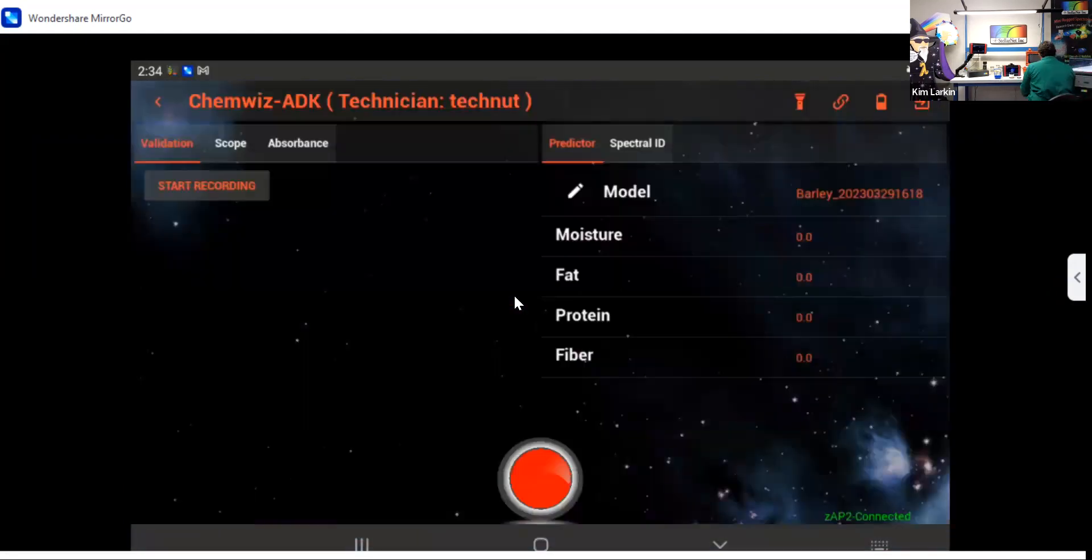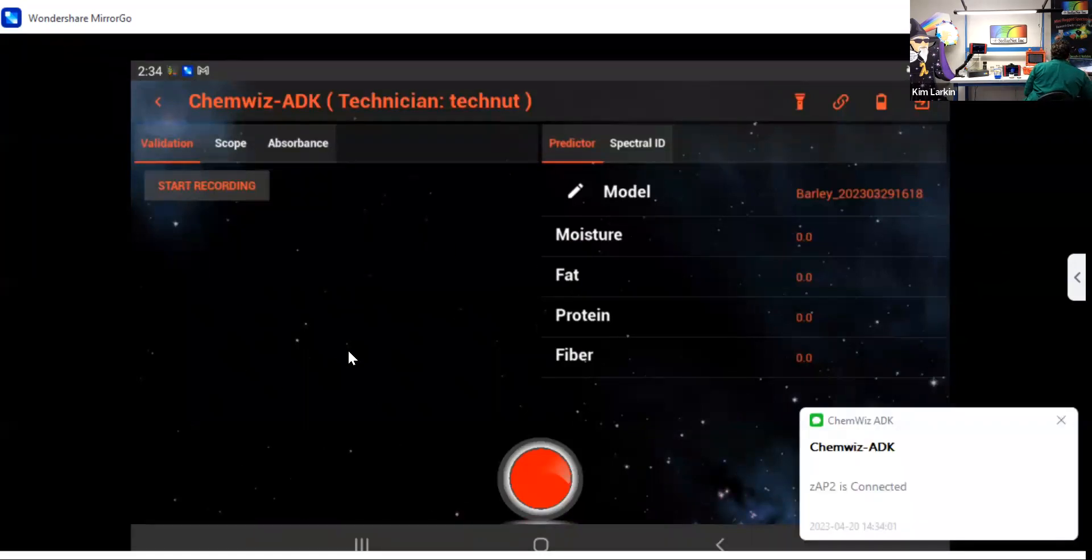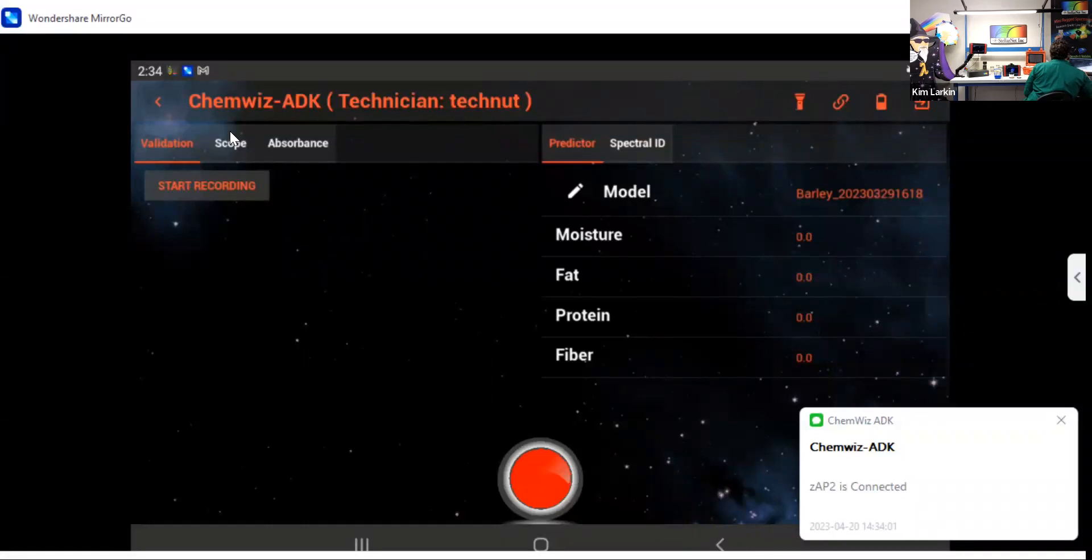Okay. So this is the ChemWiz ADK panel for a technician. You can see that you don't have a hamburger menu up here on the left. You also do not have all of the controls of the spectrometer down here on the bottom.